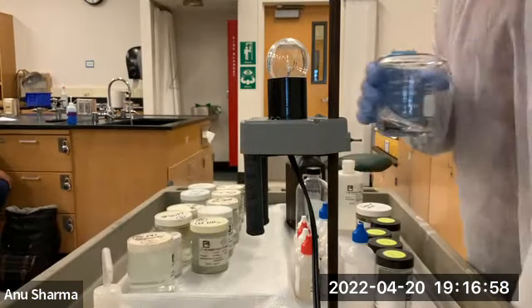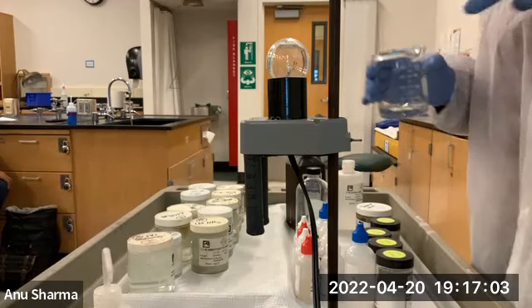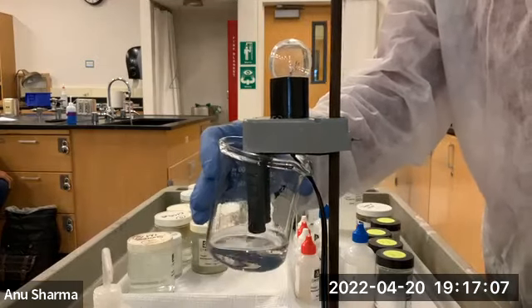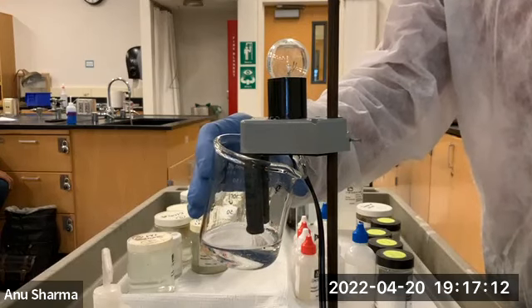Due to hydrogen bonding, C2H5OH dissolves, but the OH group is not released into the surroundings.